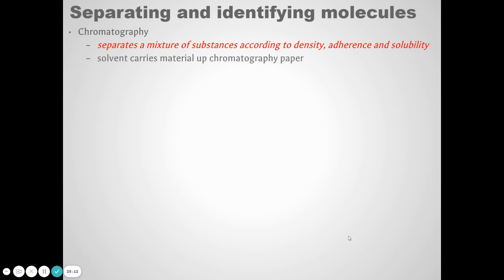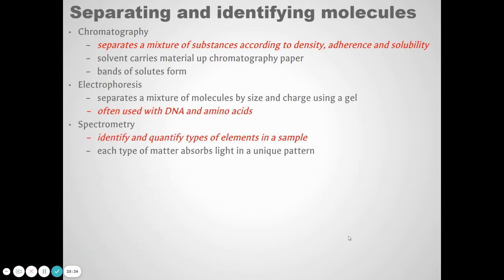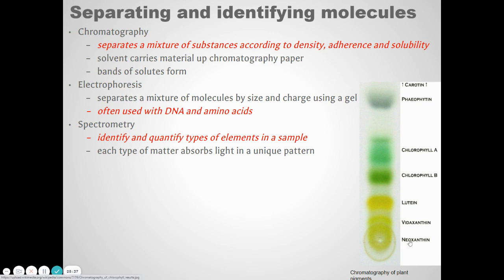You have a solution with different materials in it. What we can do is we can put a thin piece of paper, suspend it in the solution, and let the solution soak up the paper. And you get a pattern that looks like this. As the solution rises up the paper, different substances separate out.